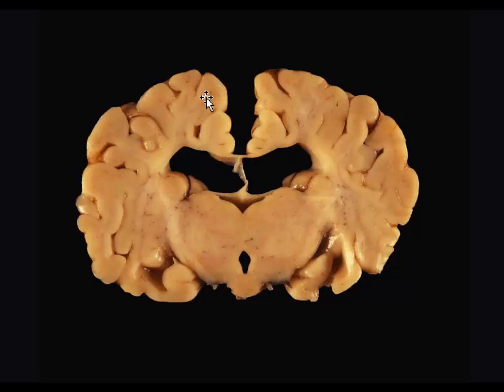And if you take a look, almost all of the cortex, well, cortex is the gray matter. Almost all of the cerebrum is cortex. There's almost no white matter at all. This is diffuse severe cerebral hypomyelinosis. And there are a couple of causes that you could think about. This particular animal is a Charolais calf, and it is one of the defects that are associated with Charolais calves.